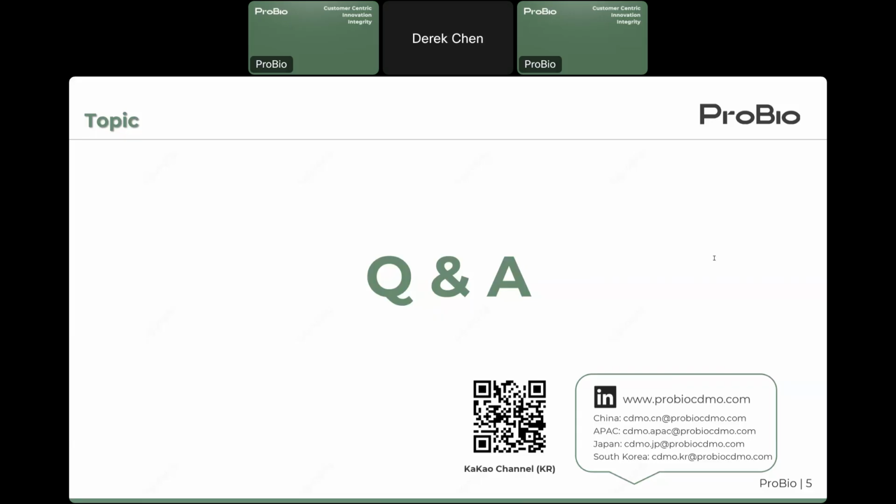Okay, and here the second question is, do you recommend mouse or rabbit immunization for the generation of anti-ID antibodies? It typically depends on whether you're doing PK or ADA. Usually I would recommend rabbit immunization and collecting polyclonal antibodies for the ADA assays as part of the control.